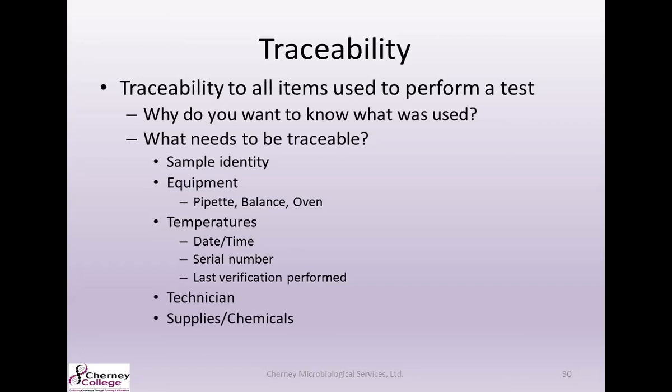used during sample prep, the incubators used to grow any sample bacteria, the temperatures, and the technician's date, time, and initials of setup and of plate reads. All supplies and chemicals and lot numbers, all of that needs to be tracked. So basically anything or anybody who comes in contact with that sample. When you want good traceability, you're going to want to make sure that you have a broad picture of everything that's happened to that sample from the time it arrived at your lab to the time that you produced results.